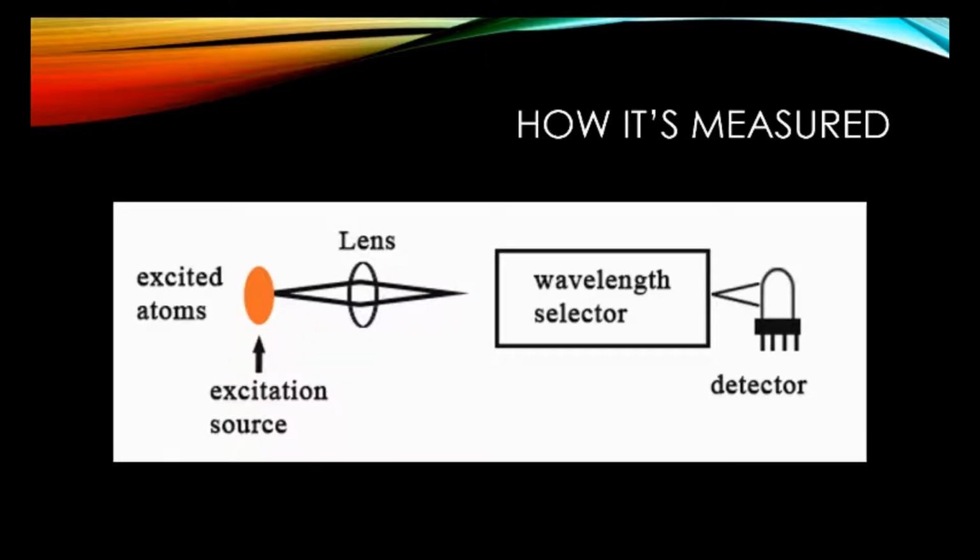The device that is used to record a spectrum is called a spectrophotometer. It isolates the specimen so that only wavelengths from the material being observed are recorded. Light then passes through a lens and finds its way to a detector, which records the wavelengths on a computer.